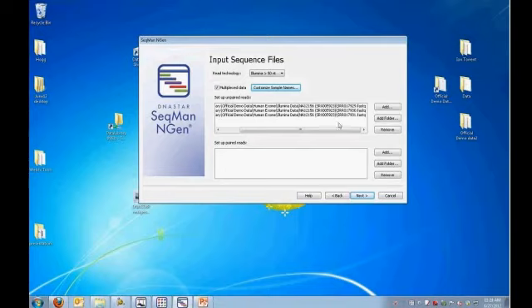With 454 data, it is a bit different. They use MID tags. In that case, if I have 454 data, our software recognizes all the known MID tags, or at least what we've seen to date. And so if you have 454, our software will look for the MID tag, bin the data by MID tag, trim, and then assemble, and then keep track of the group name. So we do accommodate both types of barcoded data.